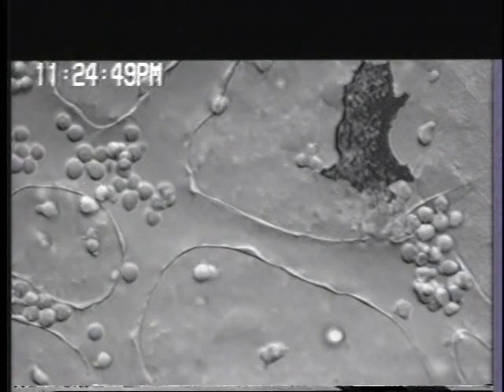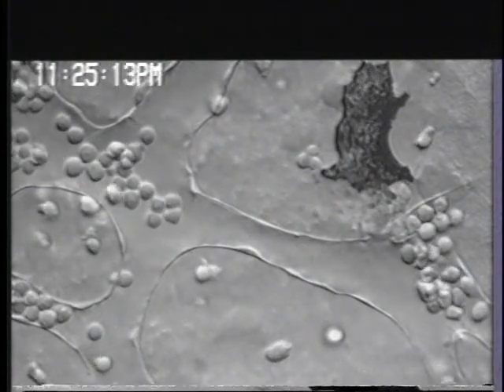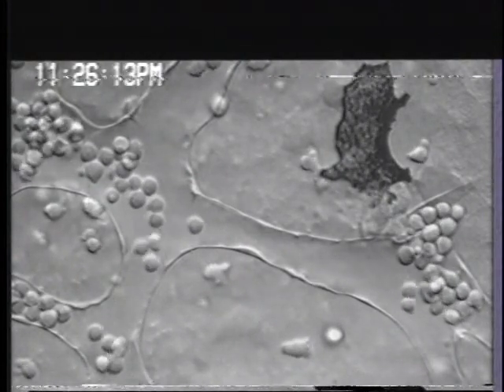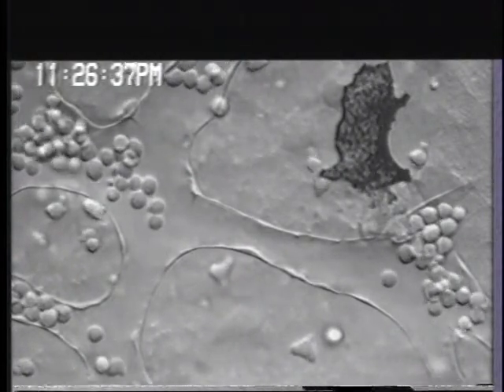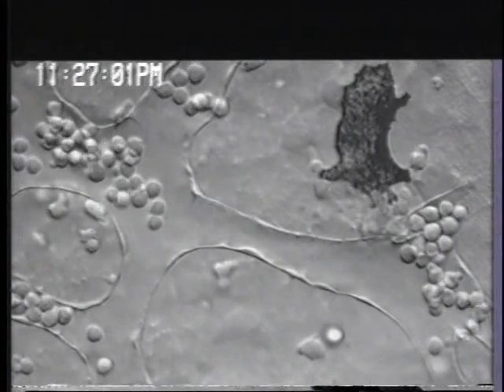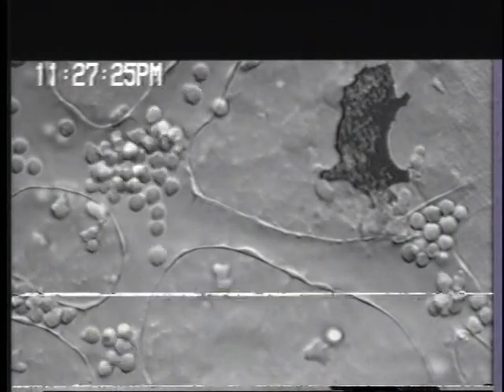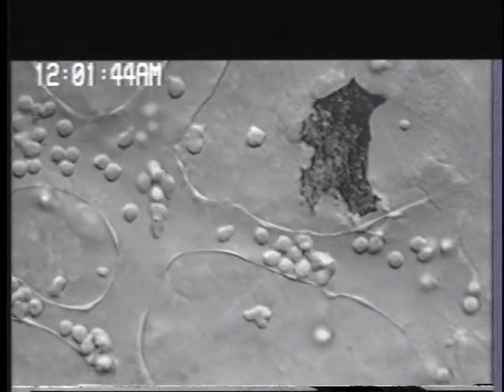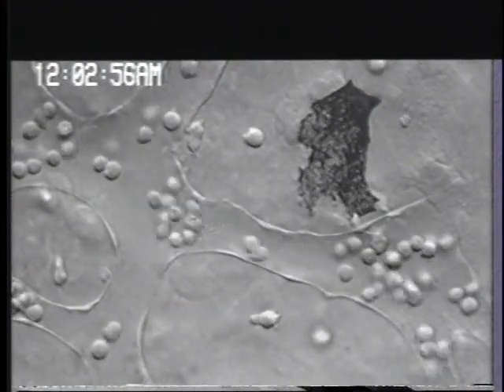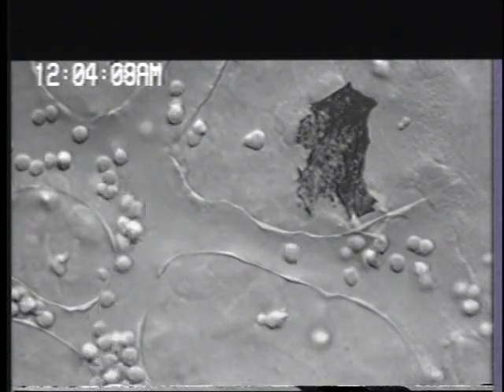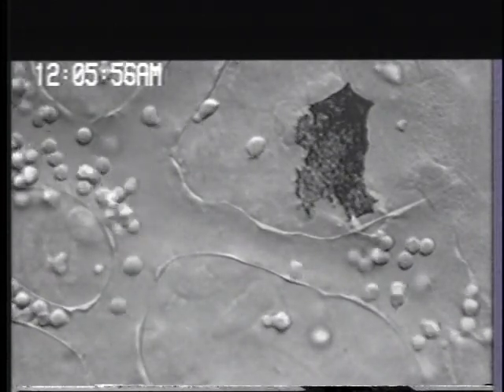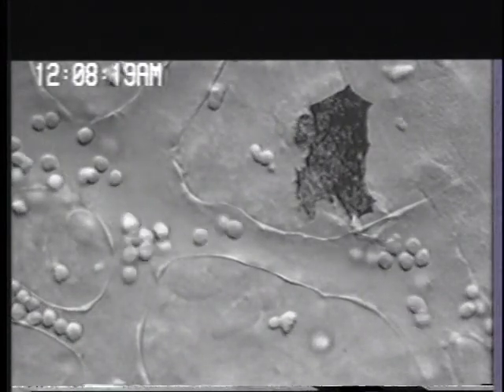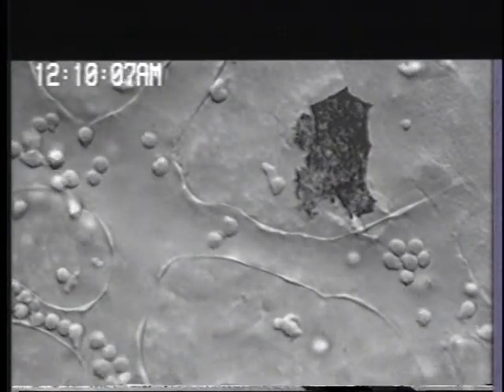As we switch recording speeds so that events appear to happen much closer to real time, we see that the blood cells are actually slowly progressing through the blood vessels as the young heart just starts to pump. When we switch back to the original recording speed, the dynamics of blood cell movement become obvious.